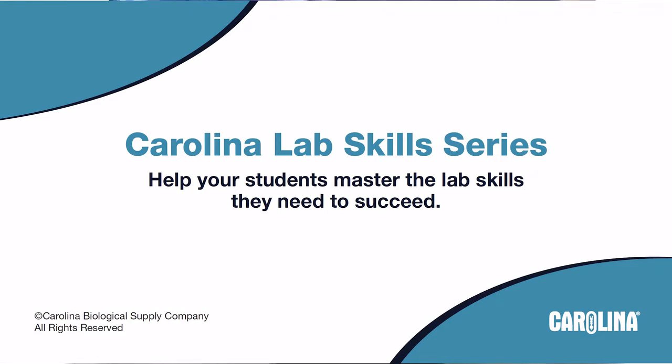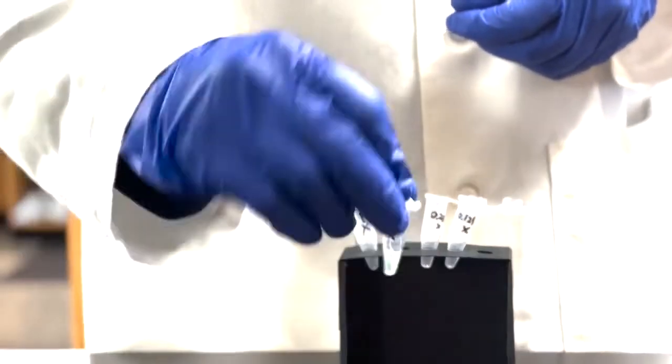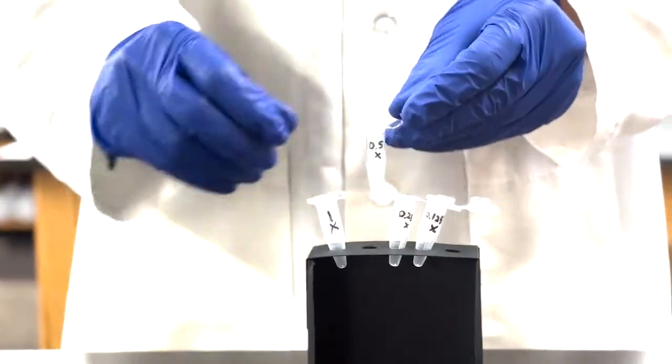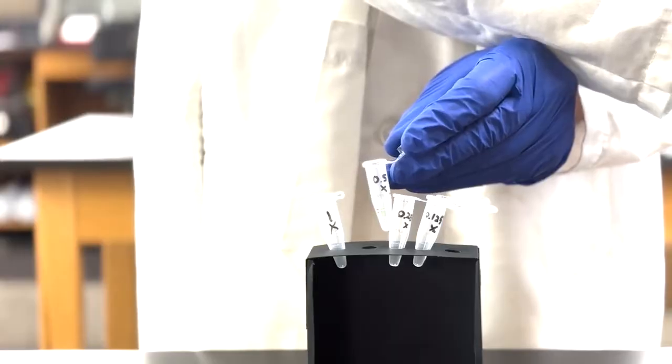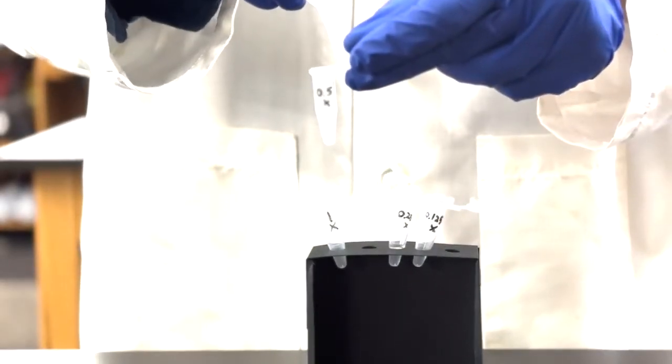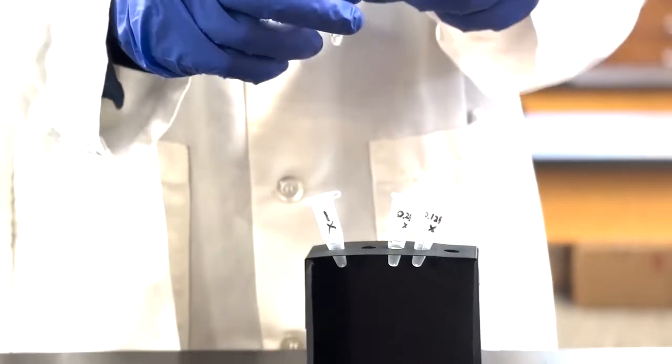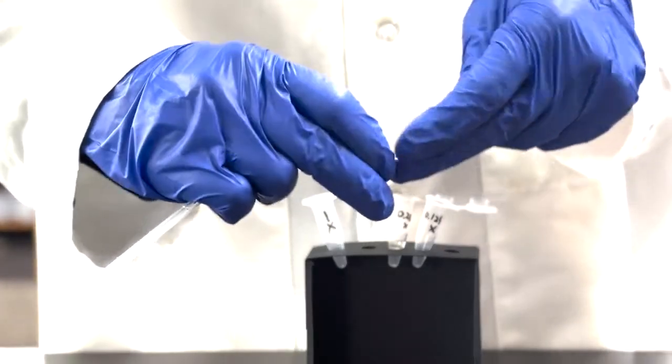A serial dilution is a laboratory technique used to create a series of solutions from an initial stock solution. Typically a constant dilution factor is used, resulting in a geometric decrease in concentration. This process involves repeatedly diluting the solutions in series to achieve the desired concentrations for experimentation or analysis.